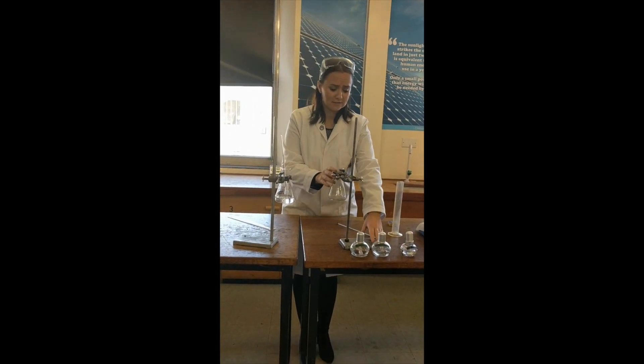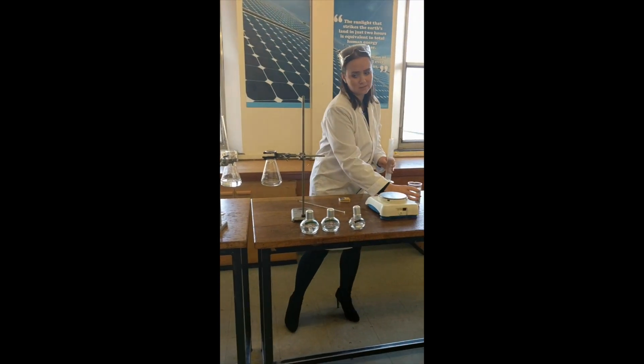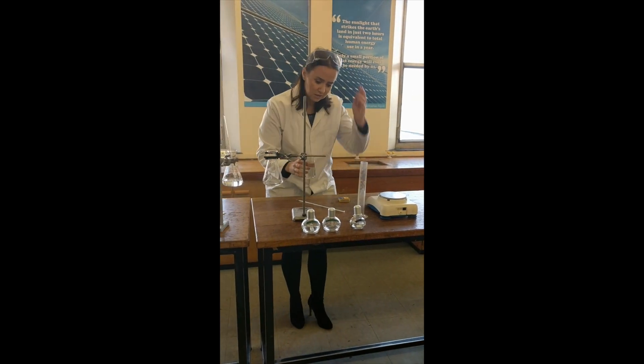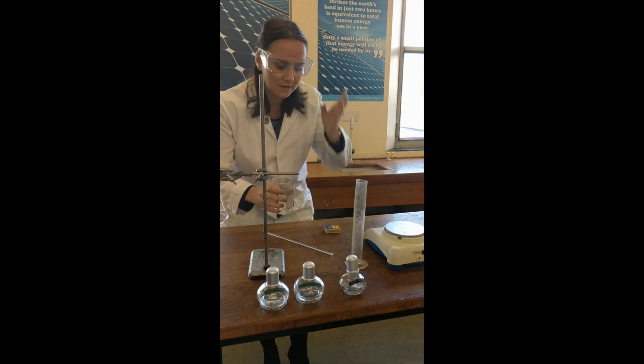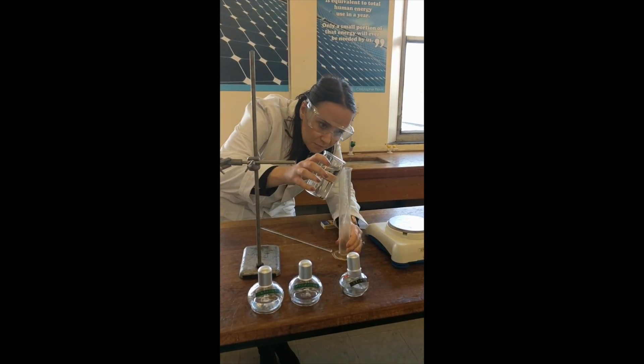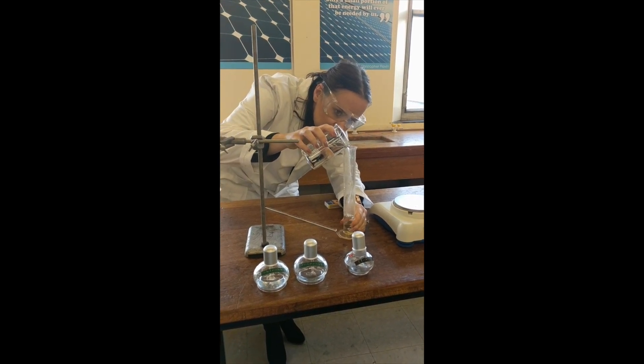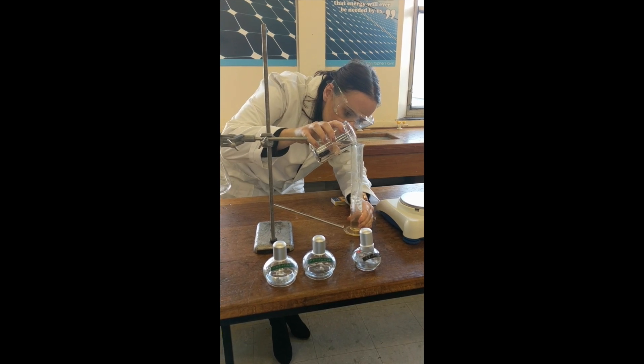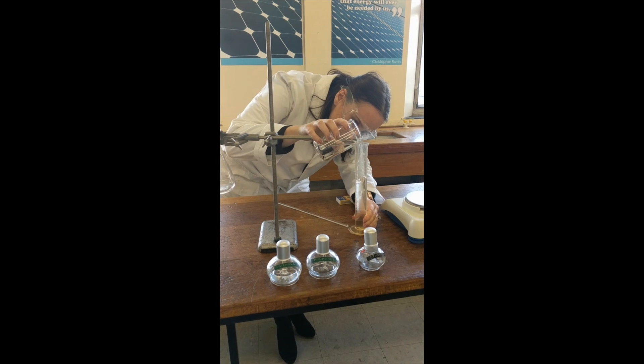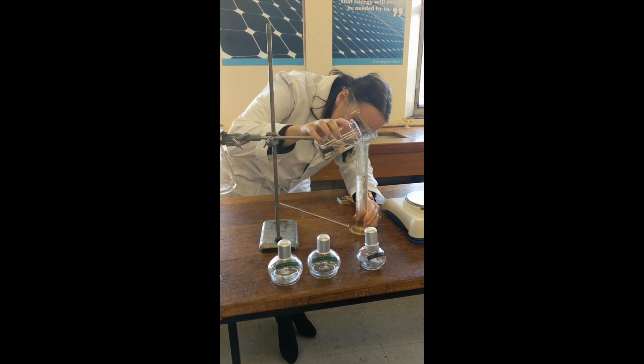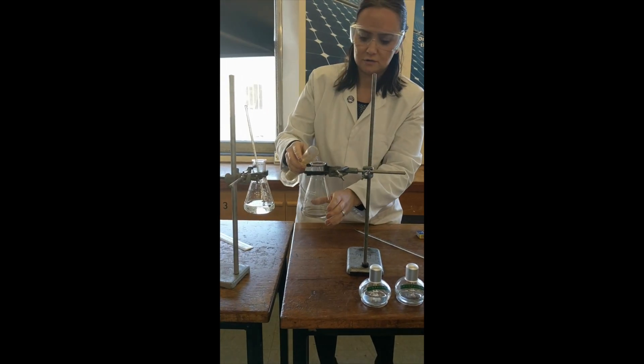I'm going to have a conical flask set up on a lamp stand. We're going to need to measure out a hundred centimeter cubed of water using a measuring cylinder. So again we're coming down to eye level to make sure we can measure the bottom of the meniscus. And we'll pour that into the conical flask.